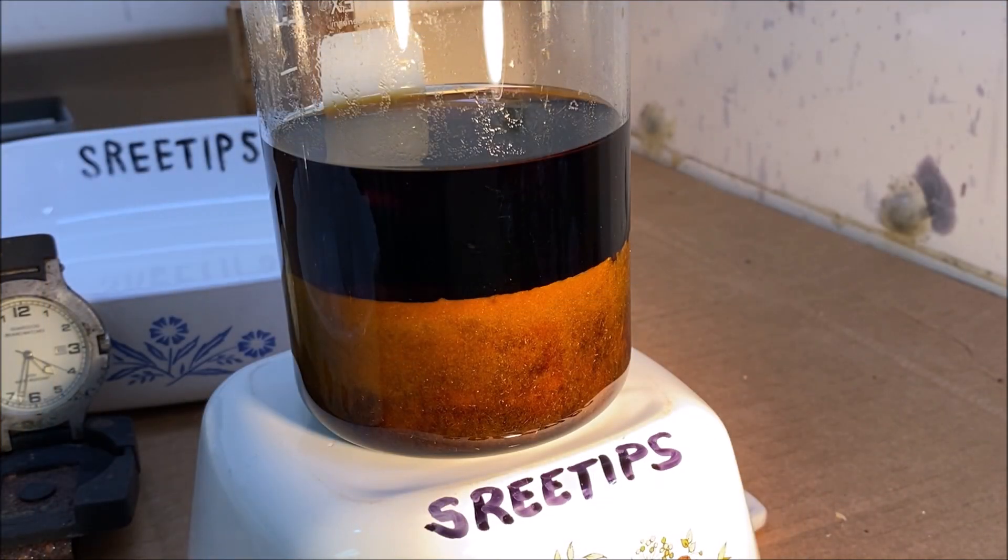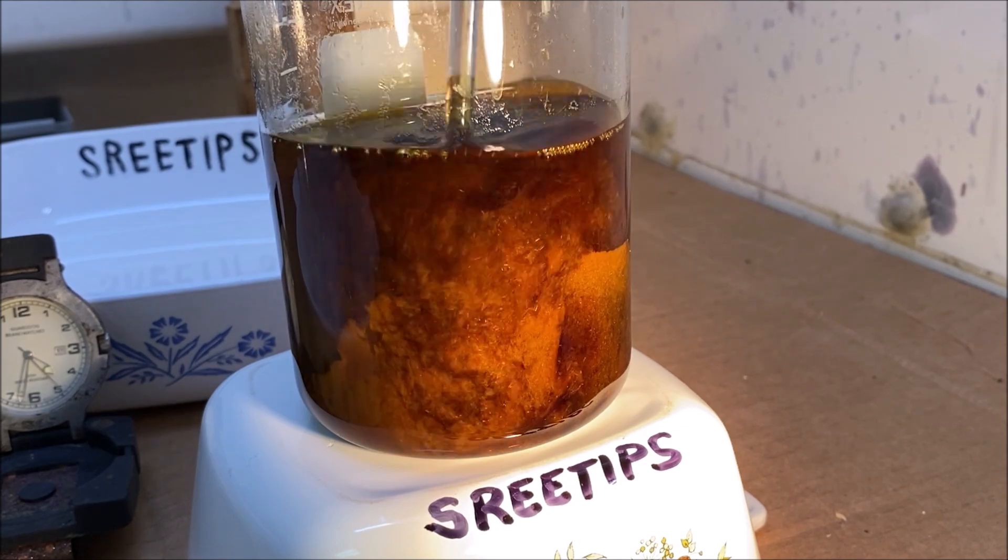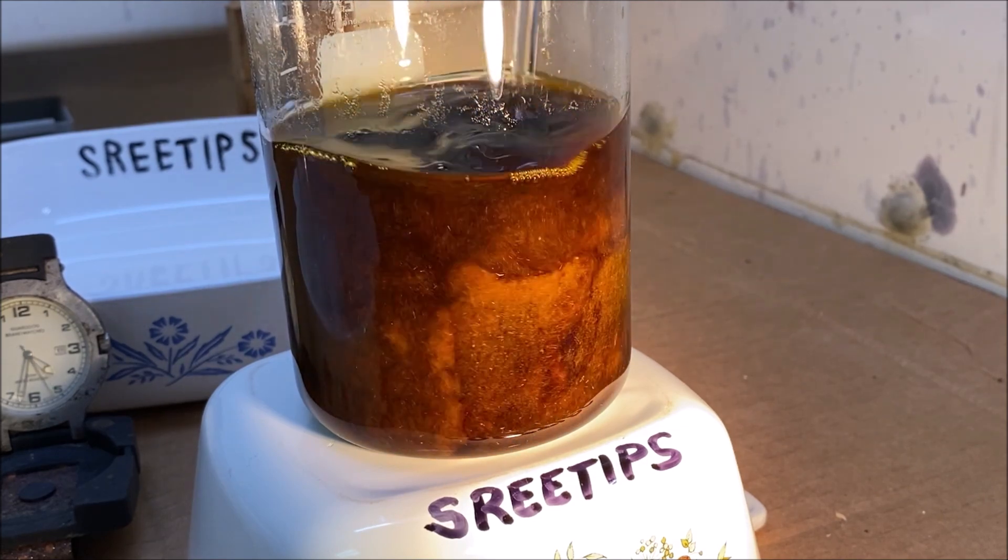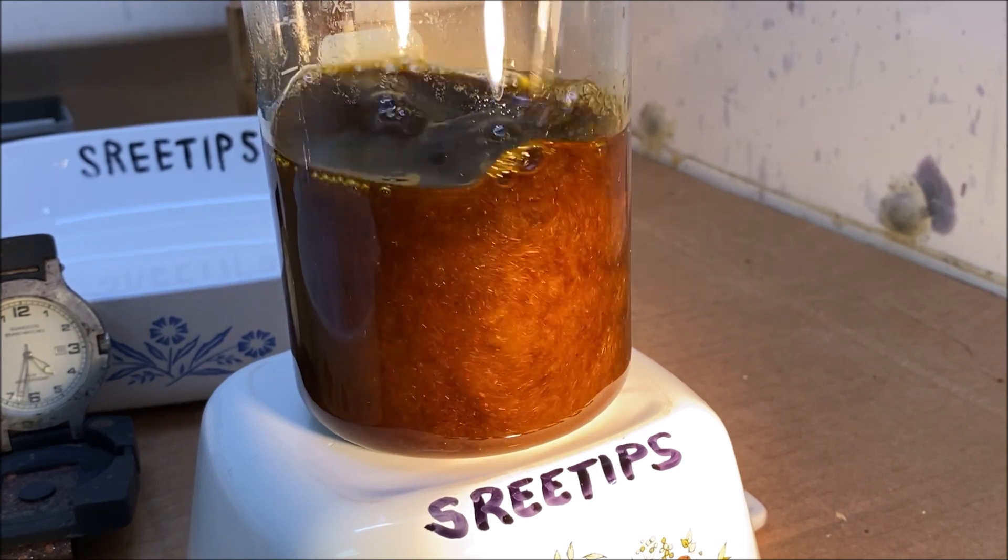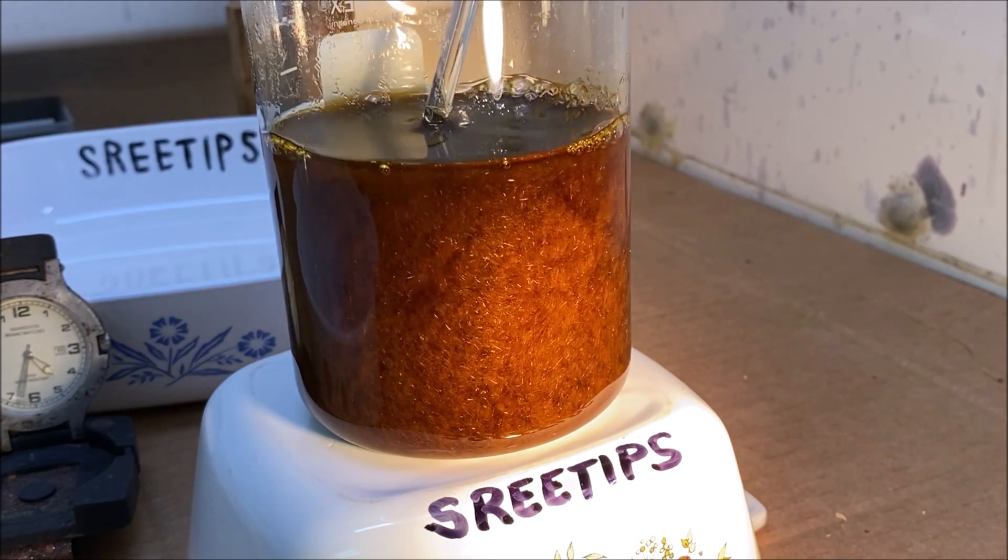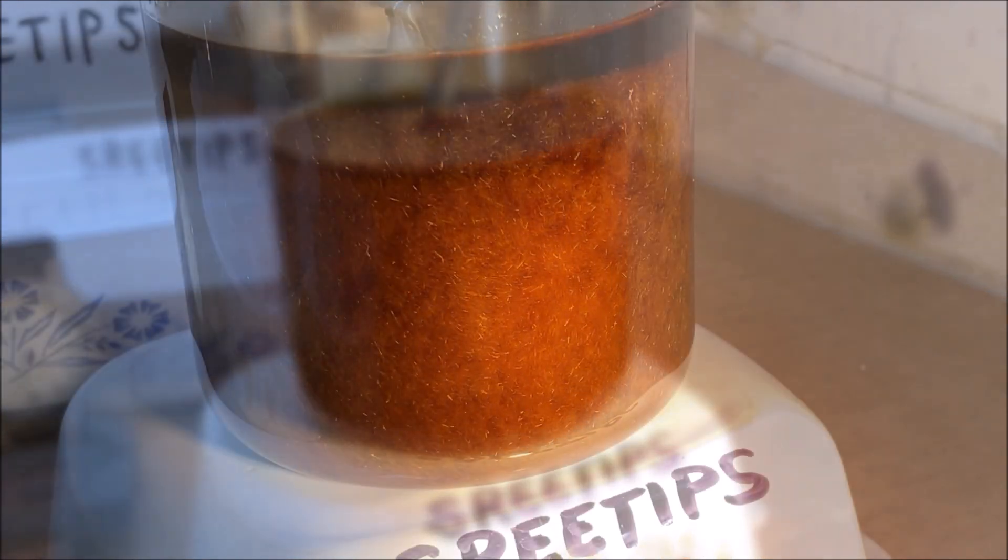All right, we've got a precipitation here. Give a stir. Okay, these are needle-like crystals instead of the nice fine-grained yellow platinum hexachlorplatinate that I'm used to seeing.